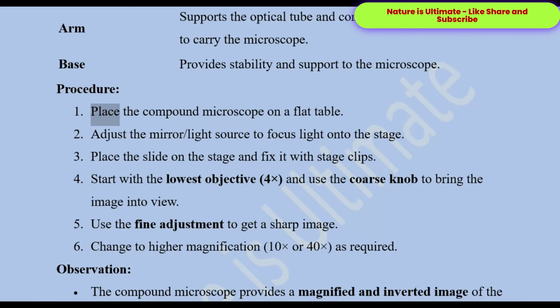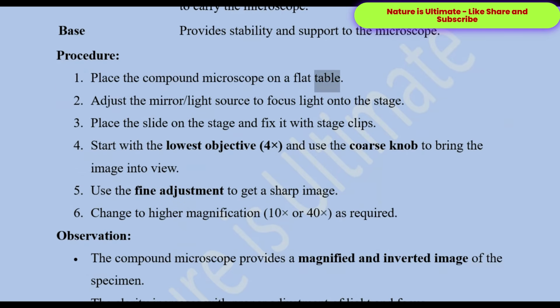Procedure: Place the compound microscope on a flat table. Adjust the mirror/light source to focus light onto the stage. Place the slide on the stage and fix it with stage clips.